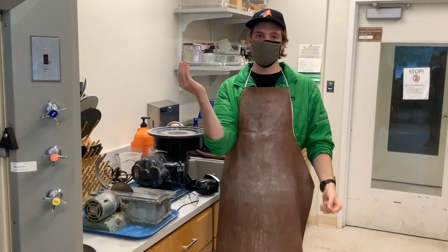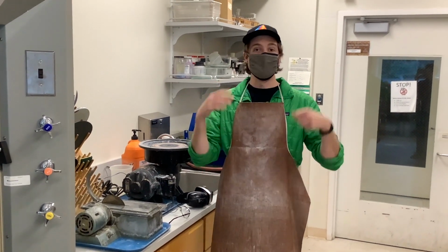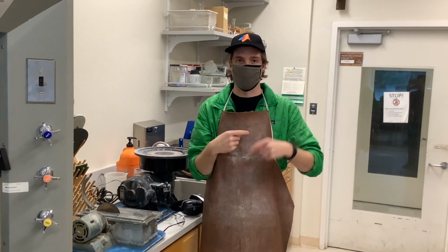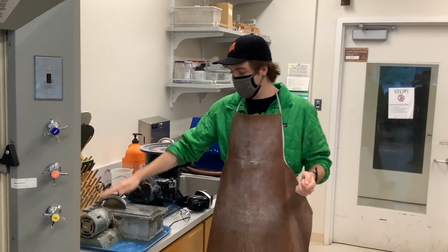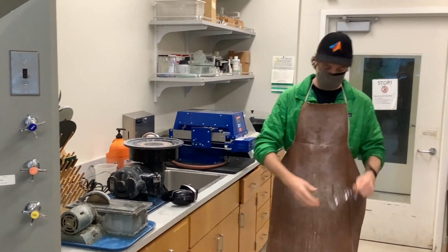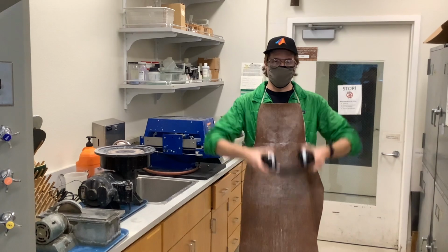This saw isn't serrated like a saw we use for cutting wood. It is encrusted with diamonds, so it's actually not sharp. But because of those diamonds, it has a high hardness, and so it can actually abrade its way into a rock using those diamonds. So what I'm going to do is I will put this little shield arm down, I'll turn the saw on, and I will cut my rock. Of course, we want to have our water splash protection, our eye protection, and this is going to be loud, so our ear protection.